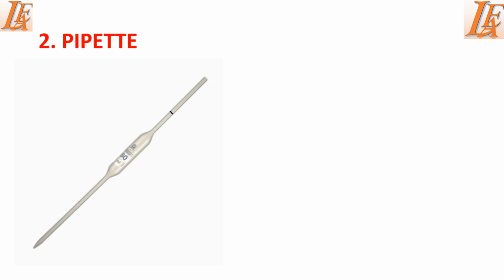The second apparatus is a pipette, and a pipette is a slender graduated glass or plastic tube, and it's used to measure and transfer fixed volumes of liquids accurately. A pipette has its capacity indicated on its side. This is what we call the capacity, the amount of liquid that this pipette can hold, and this capacity is reached when the liquid inside is filled up to this mark.